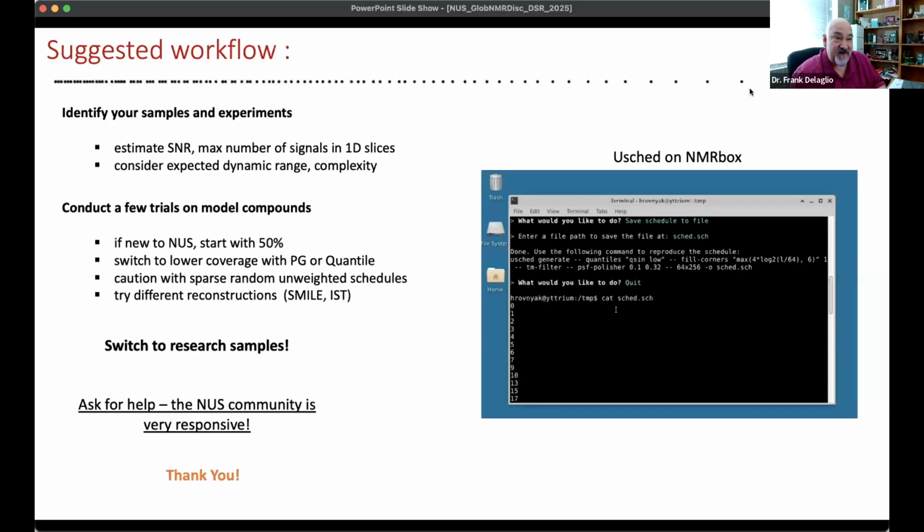So if that's what you need, once you get up to that critical number of samples, you can just measure more scans instead. And I think in a lot of cases, this is an advantage because most of these reconstruction methods involve Fourier transform steps. It's convenient if you have strong signals to be able to work with in order to do iterative types of spectral processing, which are worse if you have underlying signals that are tiny compared to the random noise.